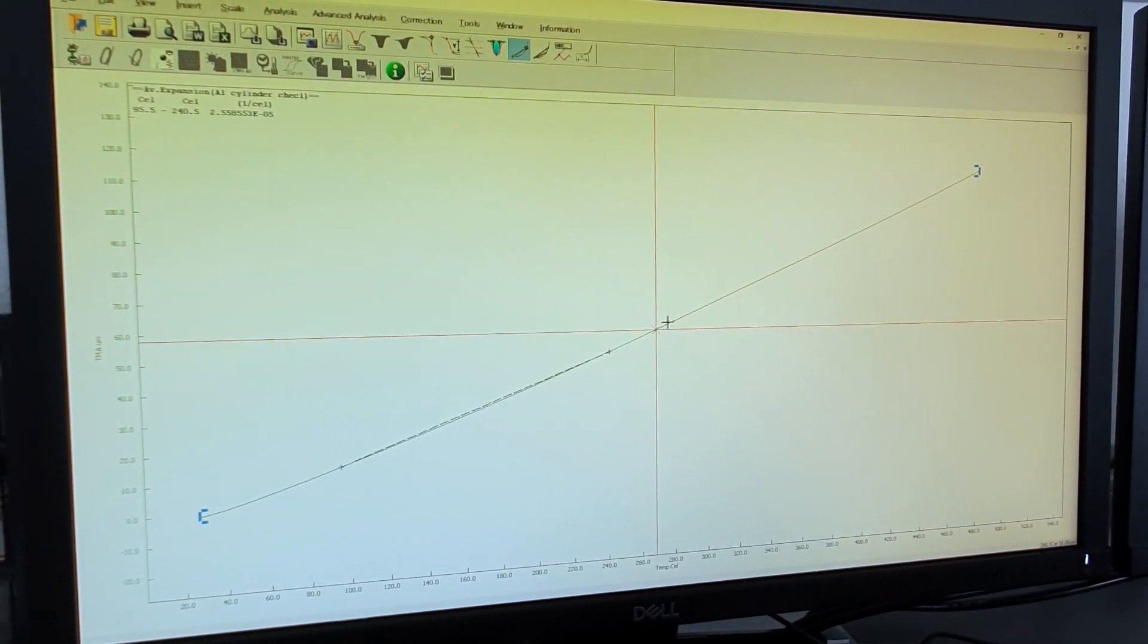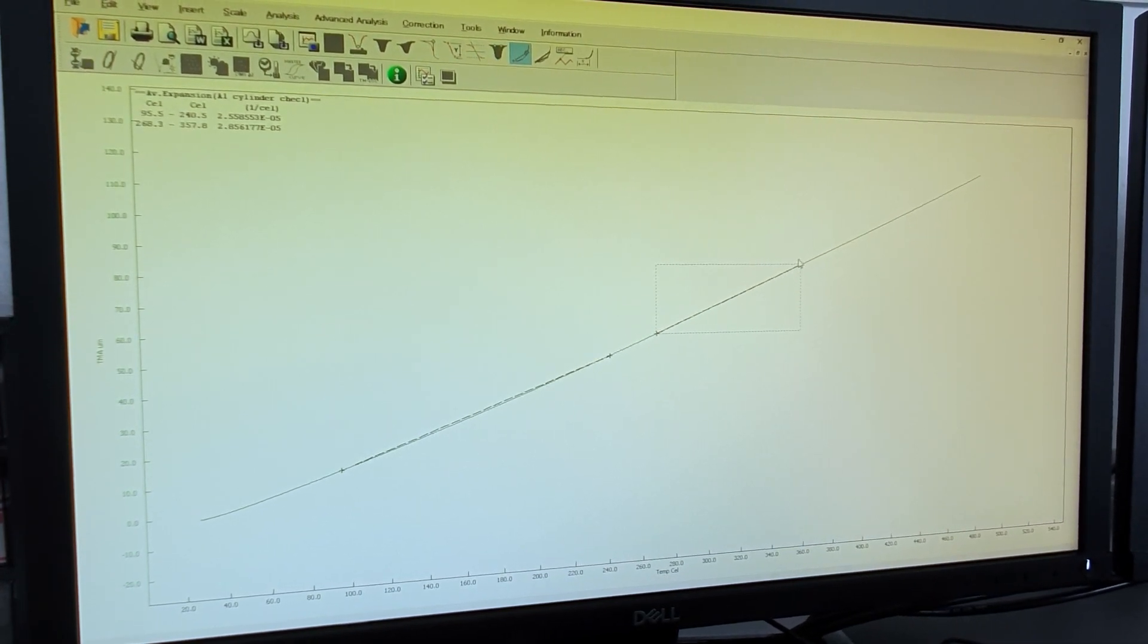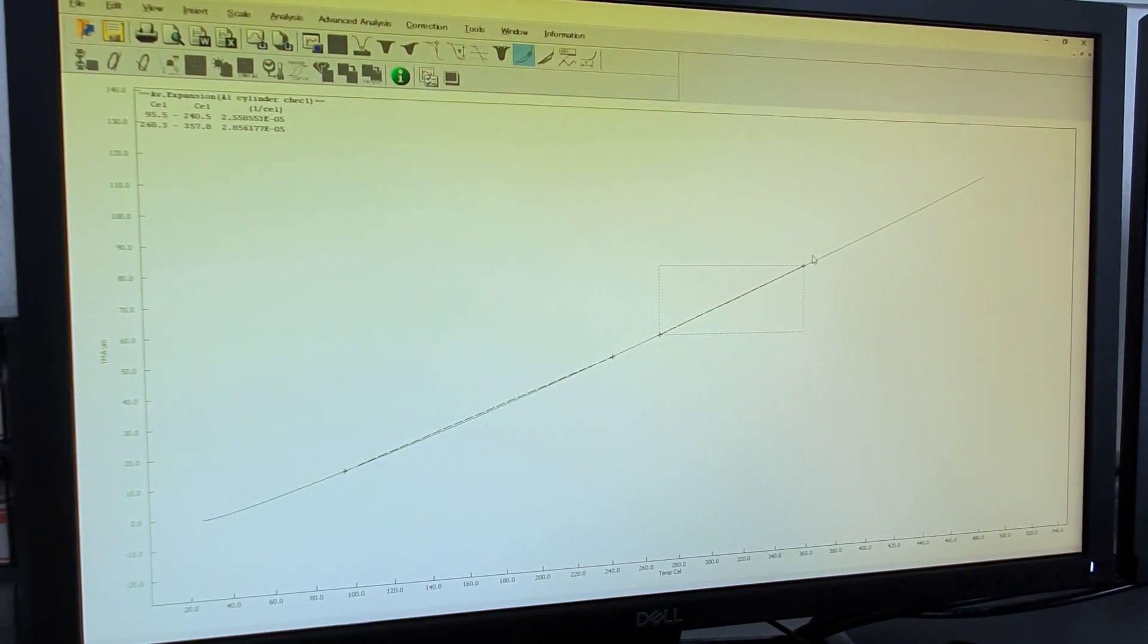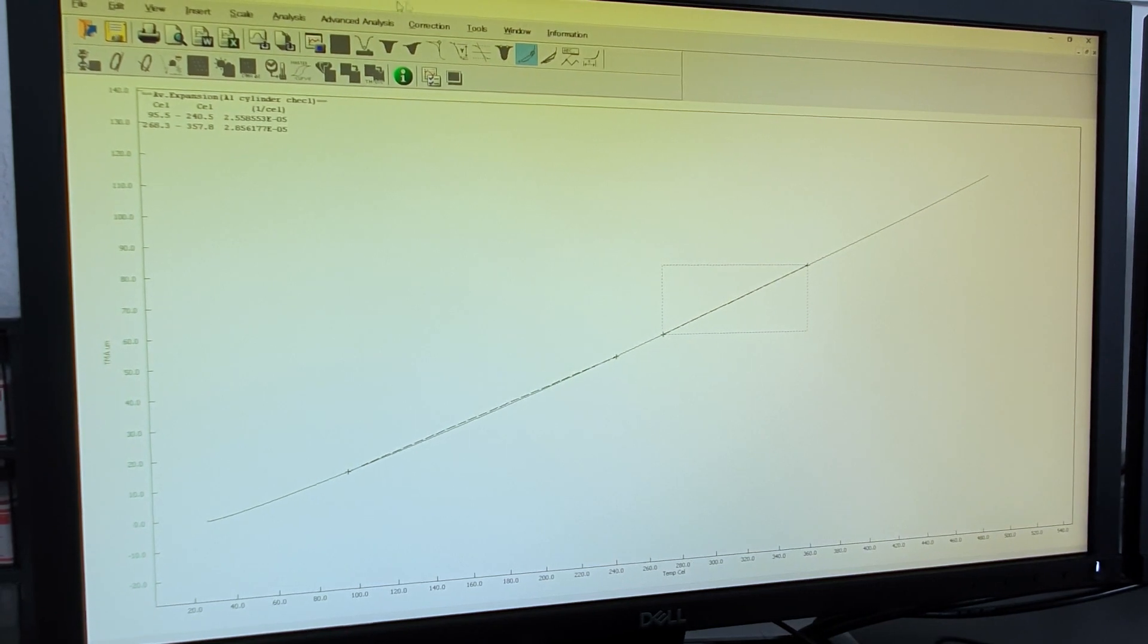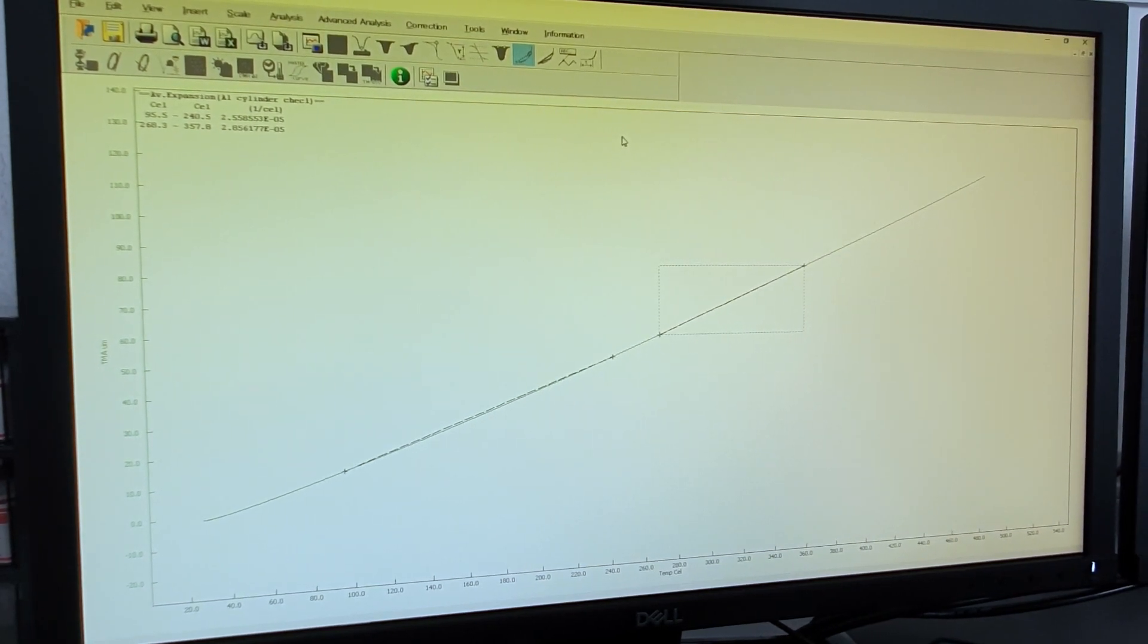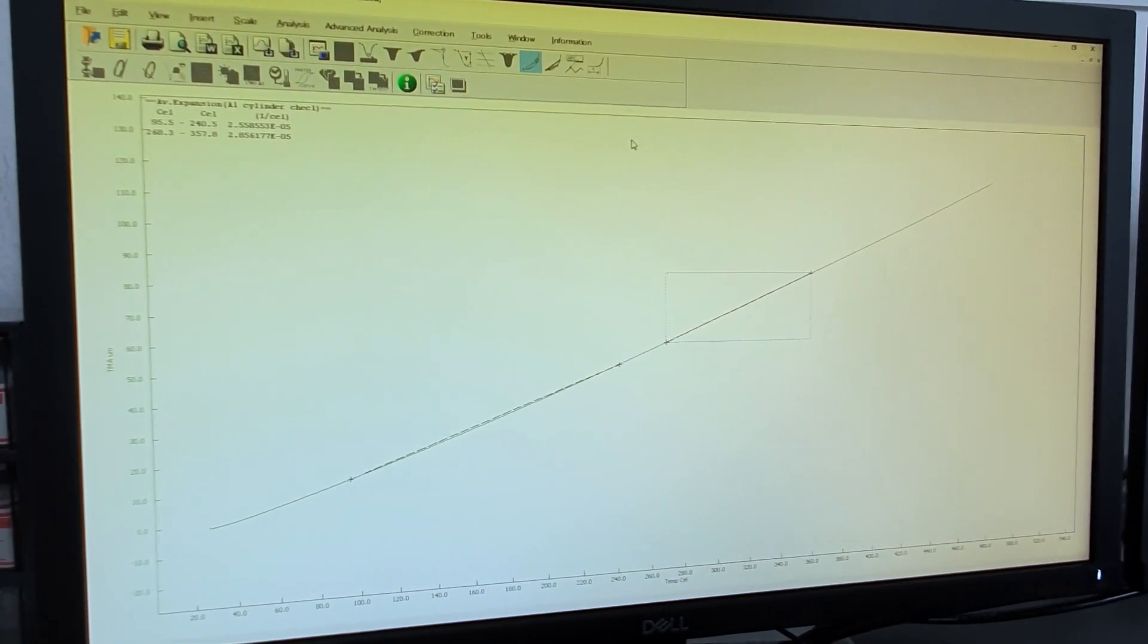Of course, you can do it on several different ranges. And this is not the only option. You have a big variety of different software tools to analyze your data according to your needs.